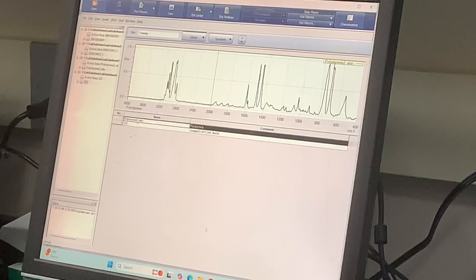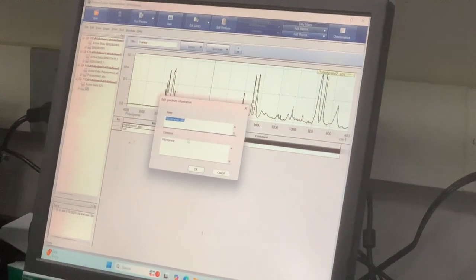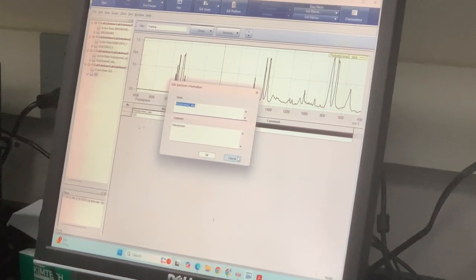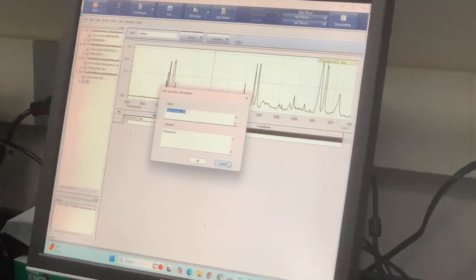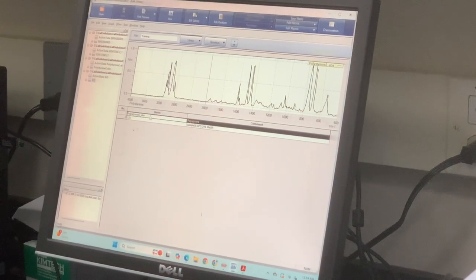So you can see these windows are clickable. So say that you want to edit it, you can also edit those names and change it to anything that you like. So say that you have aluminum layer A versus aluminum layer B, and you can change the naming to tell the difference. And so again, all of that is saved.